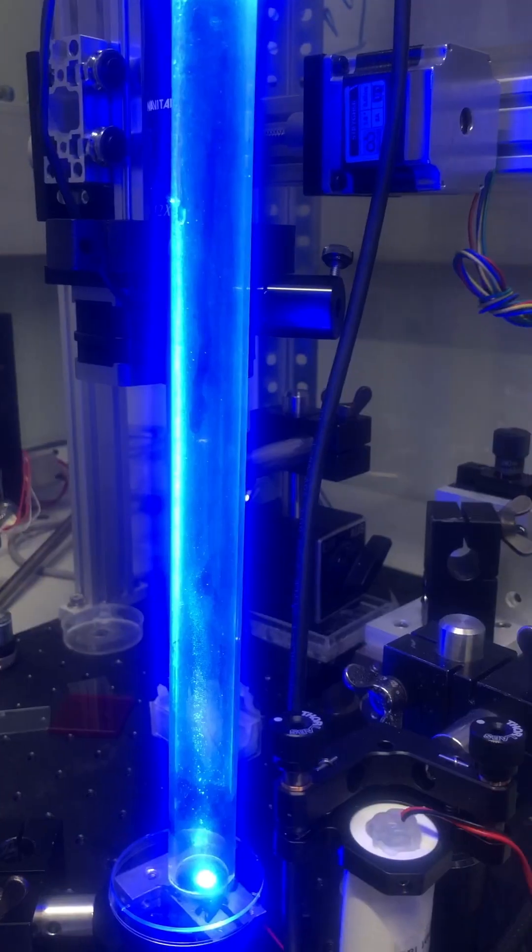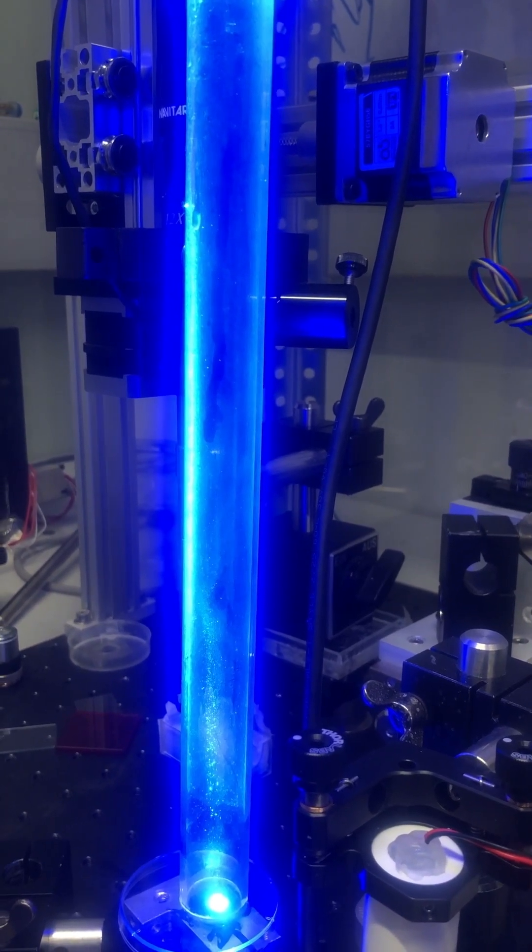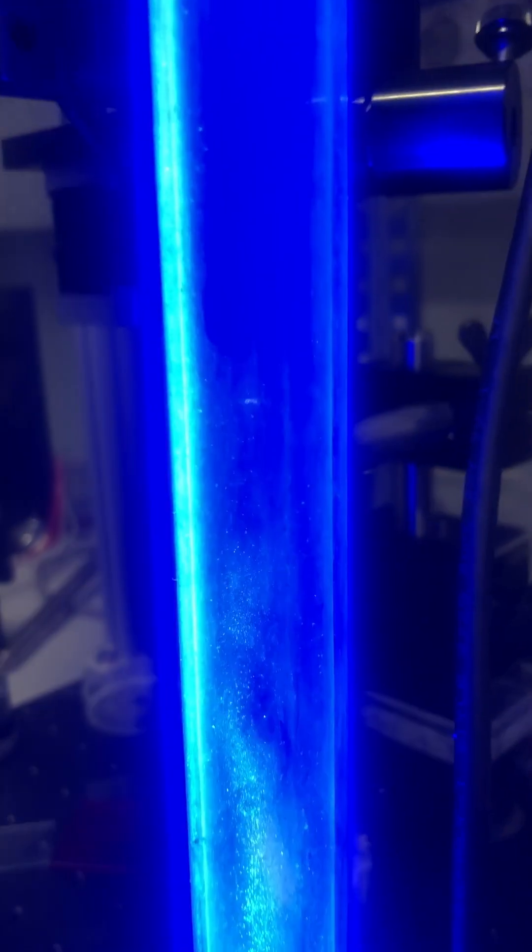Mist gets pushed towards the focus which is to the left side, but nothing gets trapped finally. This allows us to determine particle sizes, but we see a lot of small particles falling slower.